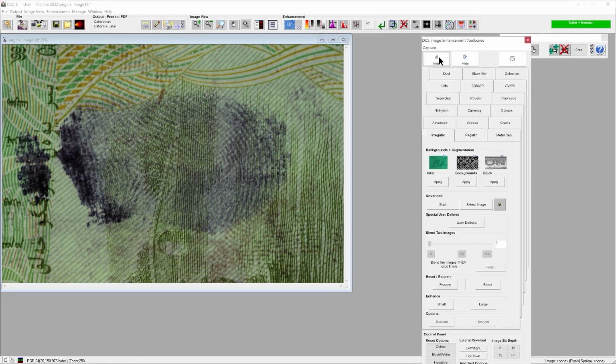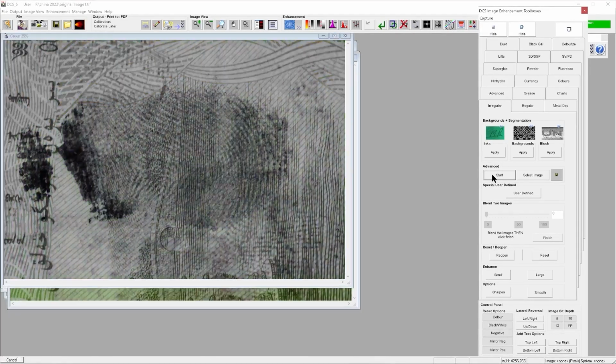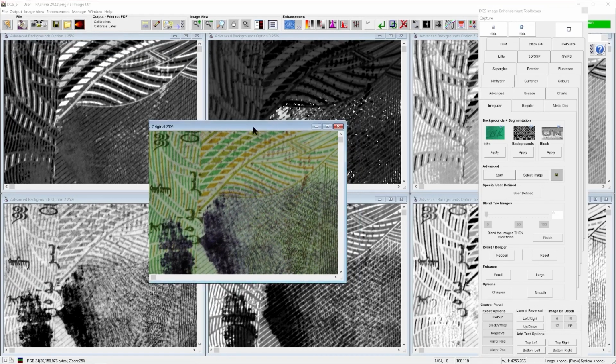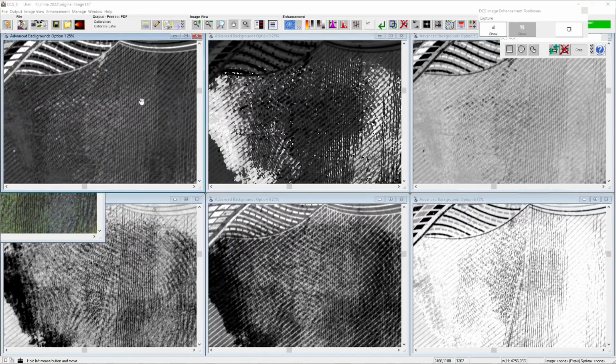So using a slightly different form of color modeling, this technique is going to give me 6 different color model images. So we have my original image on the front here, and we have a selection of different color models from my image here.